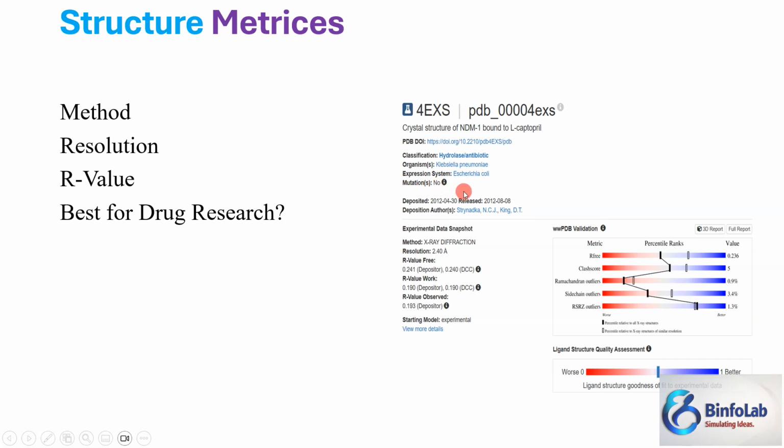One of the problems is that sometimes you are selecting your structure but you do not care for this. You must care for mutations.